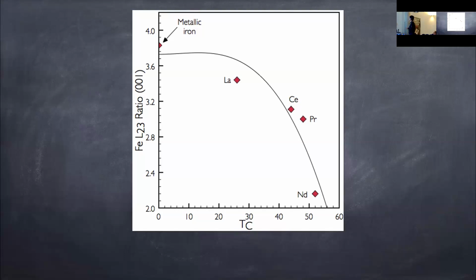What does the L3 and L2 ratio depend on in the oxidation state? For instance, this is not the case in X-ray photoelectron spectroscopy, where this ratio is constant whatever the oxidation state and depends on the number of electrons involved in each core level. What I will say is that this was an empirical observation.